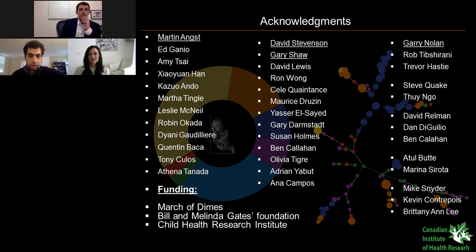And finally, the thing that we are very excited about is the idea of incorporating background biological knowledge into the models, so that a sparsification process can be guided by our current understanding of the immune system. If there are specific features that we know are robust because there have been tens of articles already published about them, when we have a large number of measurements, those features should perhaps be prioritized if everything else is equal.